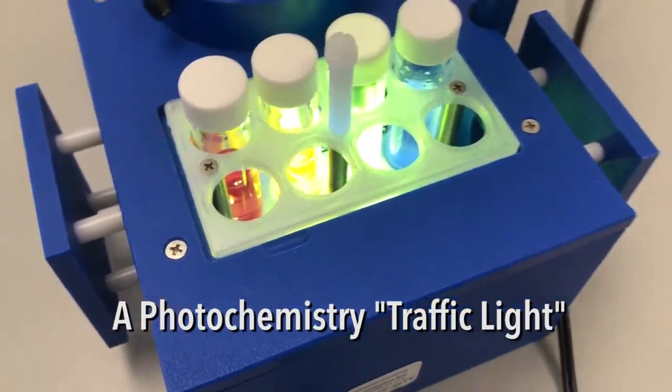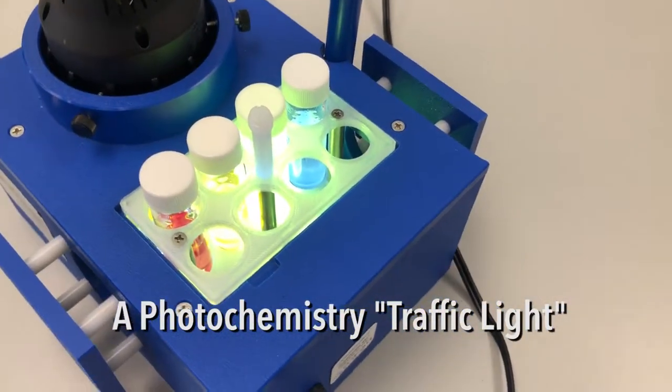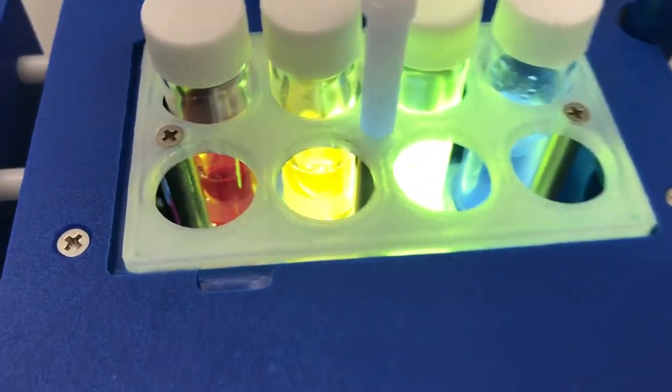Okay, we wanted to have a little fun with this video and demonstrate a photochemistry version of a well-known traffic light experiment.